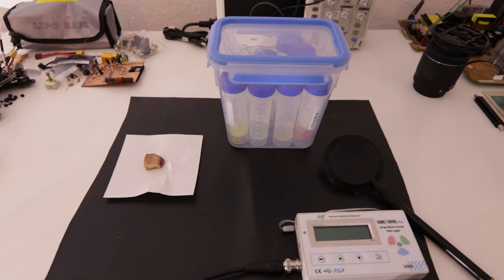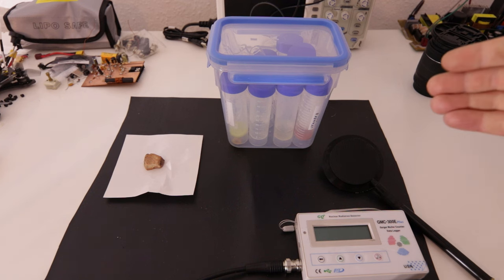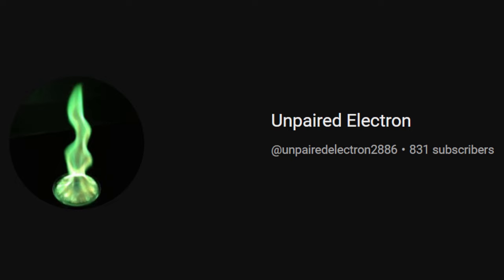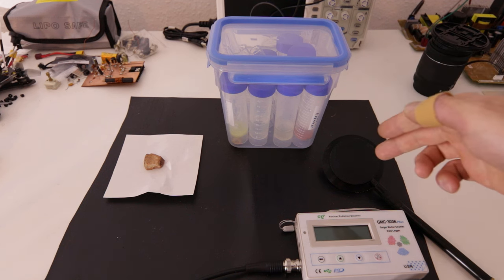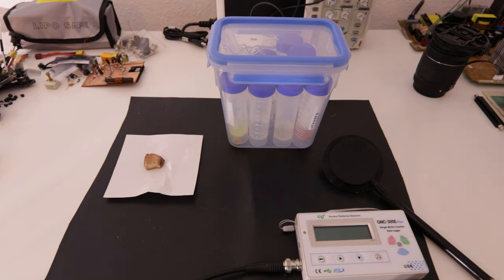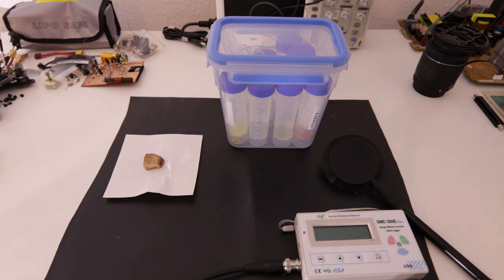There are not a lot of videos on YouTube extracting uranium. I'm more or less following the procedure provided by the YouTube channel Unpaired Electron, dissolving the uranium in nitric acid and then precipitating it out with hydrogen peroxide. Cody from Cody's Lab also made a video using hydrochloric acid first, which might be right for uranium oxide. What I have here is ortonite, a uranium mineral that readily dissolves in just nitric acid.